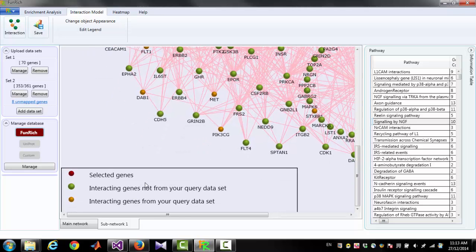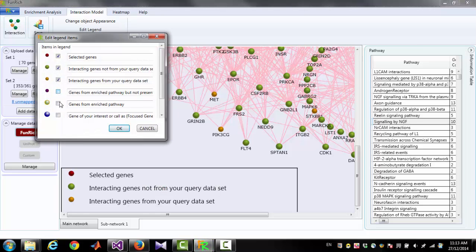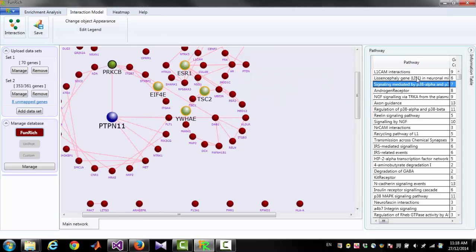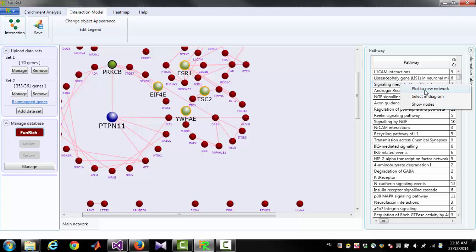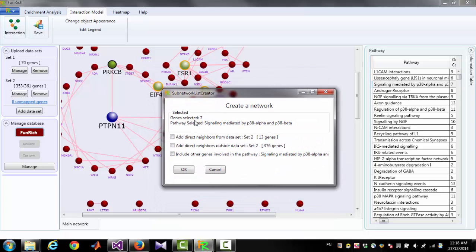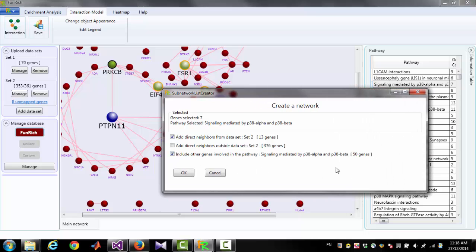In the new network, genes from your data set and genes with interactions outside your data set are shown in different colors. There is a legend below the diagram. Right-clicking on the legend, you can select and edit all the legend items. If you are interested in a certain pathway, you can select it and right-click 'Plot to New Network', which will create a new network for the genes on that specific pathway. You can also include other genes associated with that pathway.